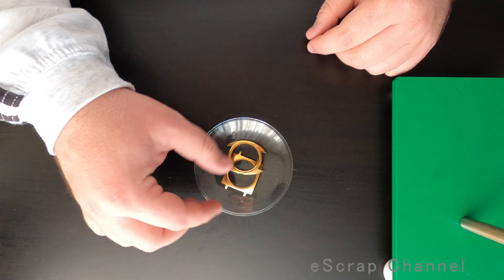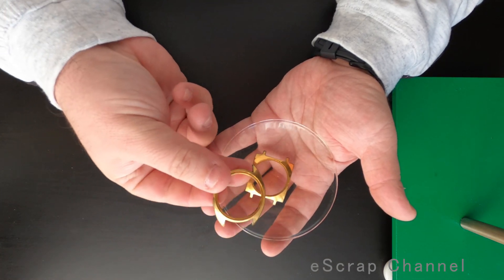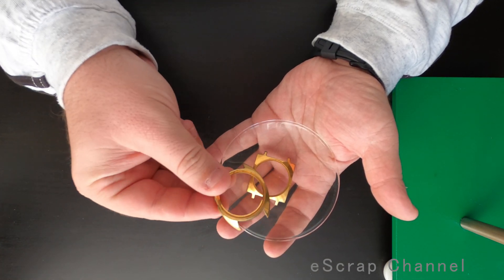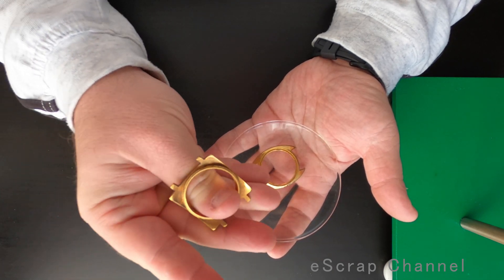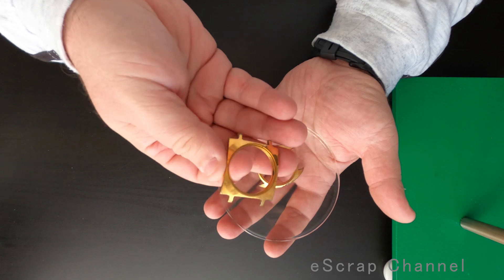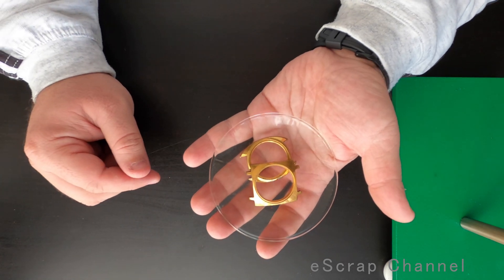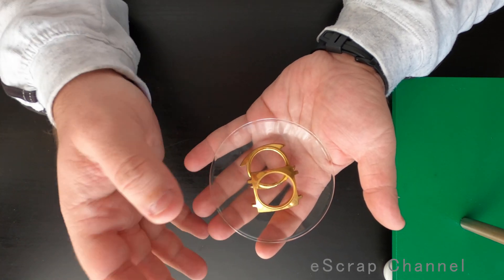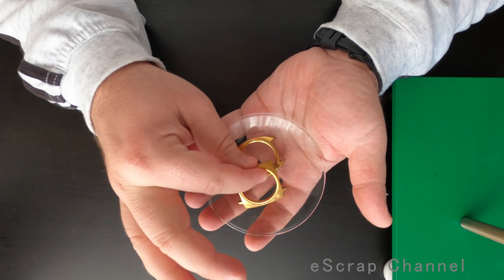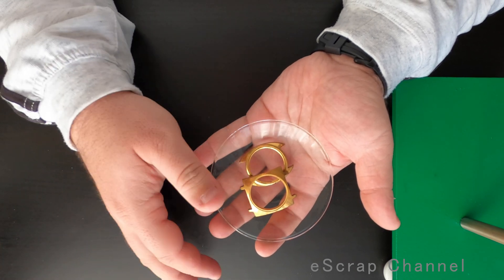Hello Scrappers! Let me show you what we'll be doing today. I have two nice gold plated pieces of metal from old watches — Russian ones — and unfortunately they are not really good. They have probably about 0.2 grams of gold, but a friend of mine gave me these two and asked me to please take the gold out from them for him. So that's fine, it's really quick and I'll do this for him.